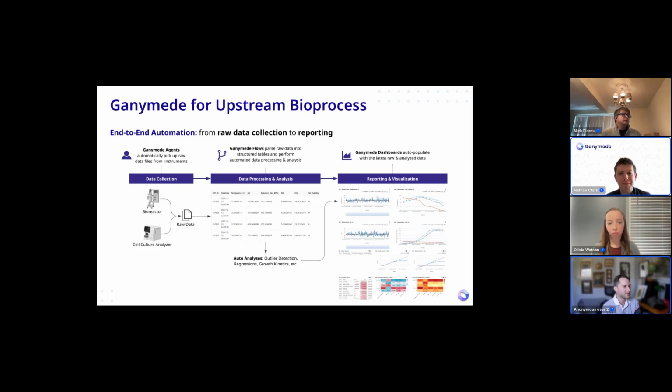Thanks, Nathan. Nathan just gave kind of an overview of the Ganymede platform as a whole and some of the capabilities here. I'm going to spend a couple slides talking specifically about what is Ganymede's solution for bioprocess data. And through the demos today, what we'll see is our modular analysis application for upstream bioprocess, which Nick Flores is going to present in just a little bit. But just to kind of walk us through what our solution is for bioprocess.